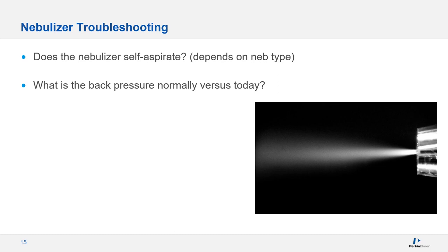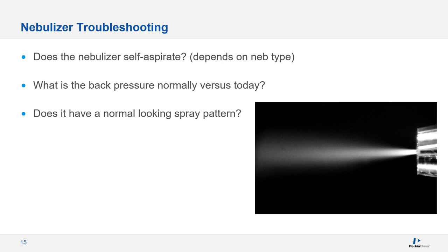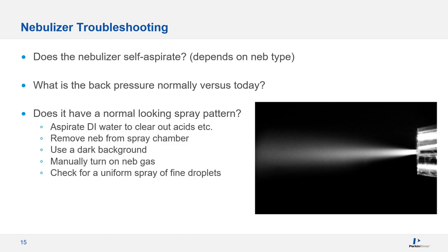If your nebulizer isn't displaying a normal spray pattern, which is a uniform spray of fine droplets, it needs to be cleaned or replaced. If you're going to remove the nebulizer from the spray chamber to check the spray pattern, be sure to flush out any hazardous components before doing so. Aspirate only water to check the spray pattern. For the best view, you'll want to use a dark background. You're looking for spitting, large droplets, or the aerosol shooting off to one side. That would indicate a partial plug.